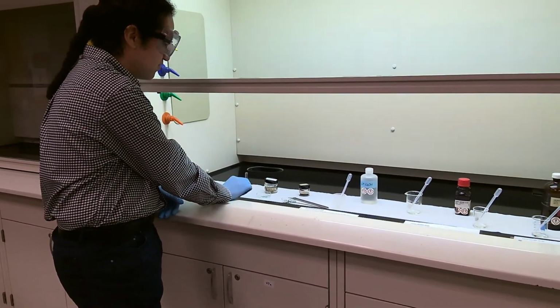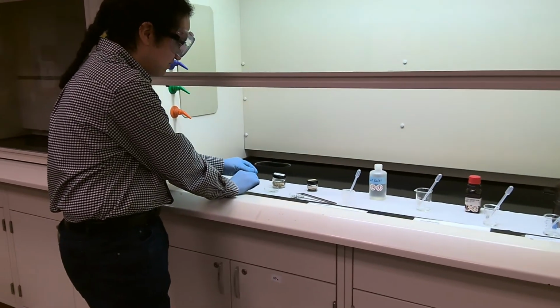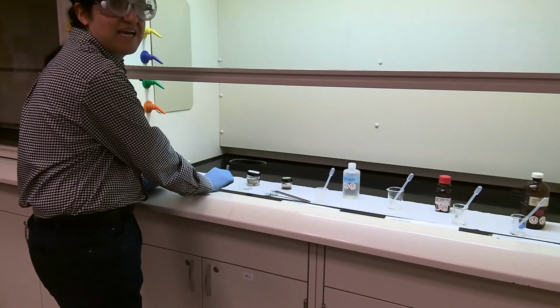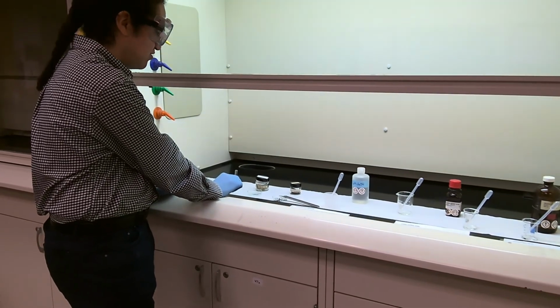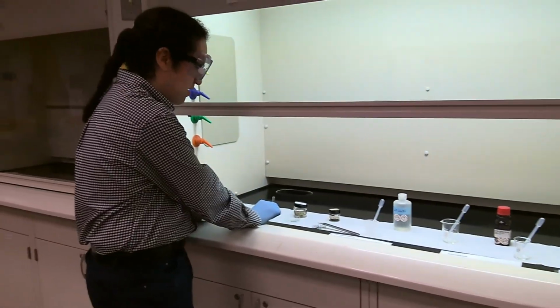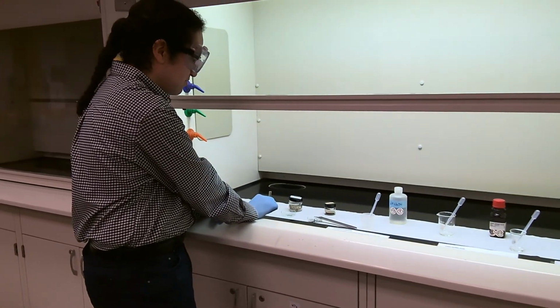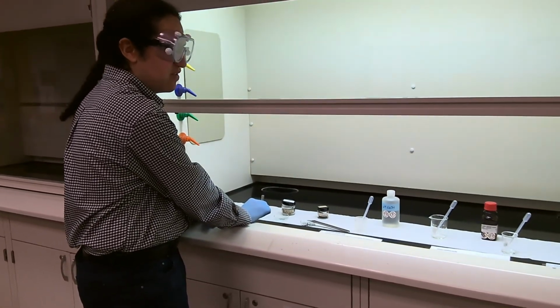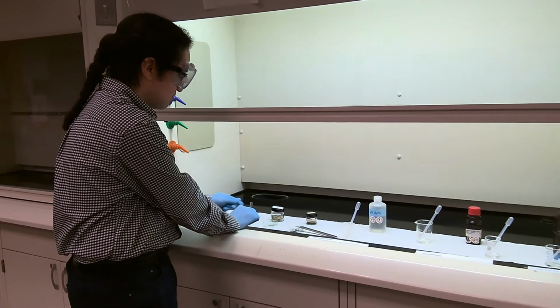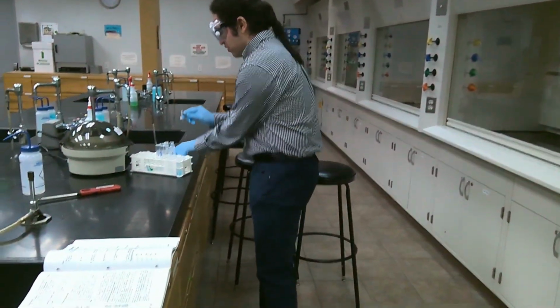Allow it one moment for the reaction to calm down before I bring it closer to the camera, just so that way we don't have any spill issues. This is a highly exothermic reaction. The test tube is quite warm in this case. Again, always make sure you're practicing proper lab safety and pointing things away from you, and you always have an external device to hold warm objects rather than holding them with your bare hand. I'm going to transfer this to the test tube holder.